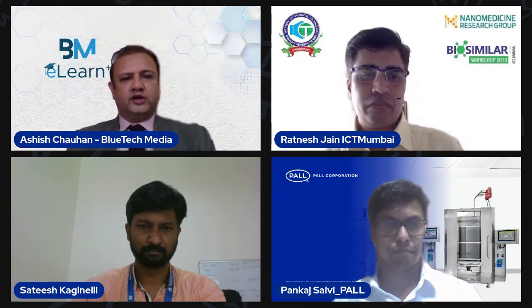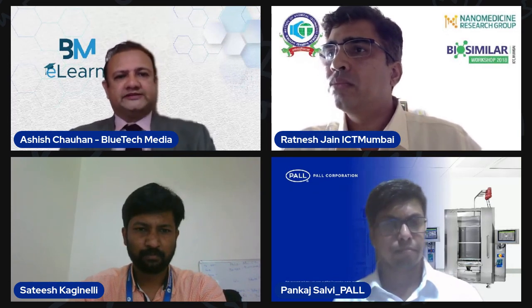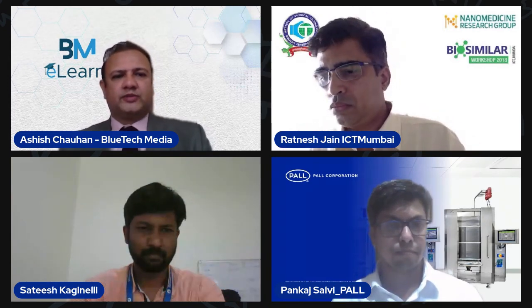Thank you. The next question is for Pankaj. If the bioreactor is cubical, then doesn't it differ in mass transfer and performance from a traditional cylindrical bioreactor?